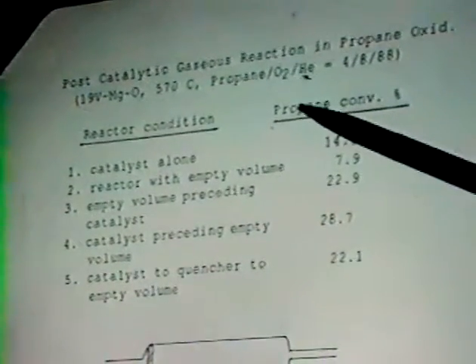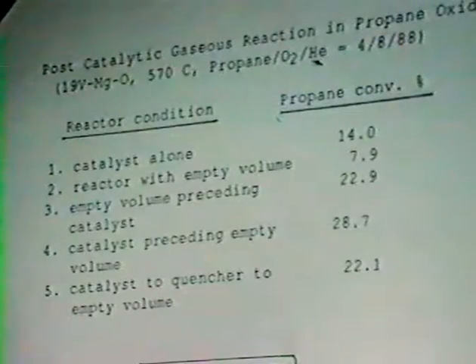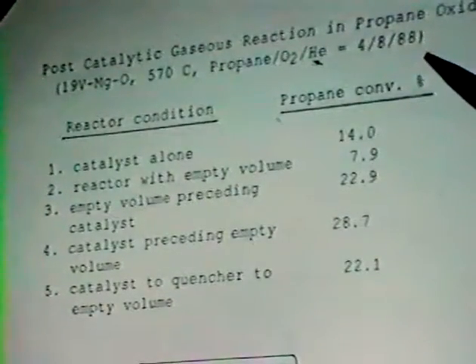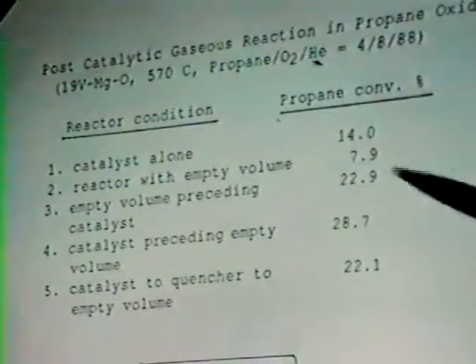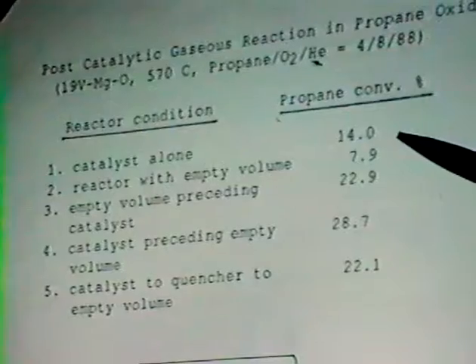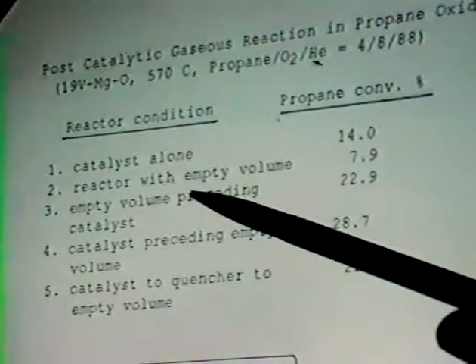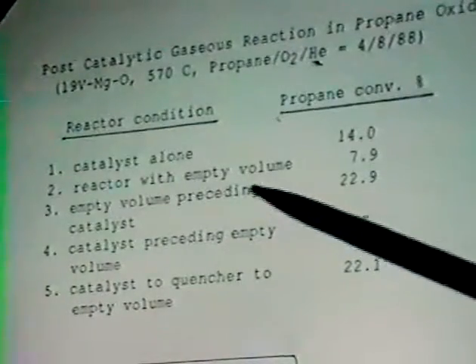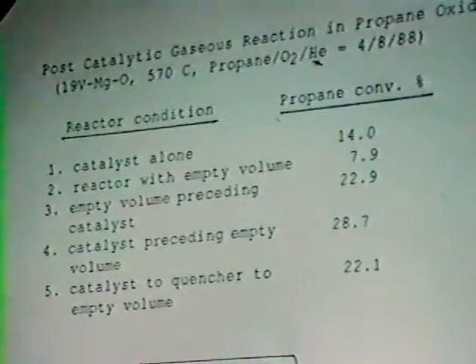And the propane to oxygen ratio was 4:8, and this is the standard condition that we use. When we use the catalyst alone, so that there is no gas phase reaction, the conversion was about 14%. With the reactor alone, without any catalyst, under these conditions, the conversion is about 8%.